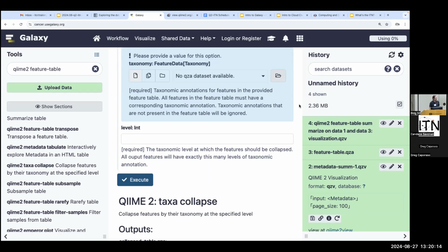And then the last thing we wanted to do here was not create some new file format. Our minimal approach was to describe the structure of the zip file, but in a way that's very human accessible. Like I said, you can unzip it, poke around in there, and find the data that you're looking for.